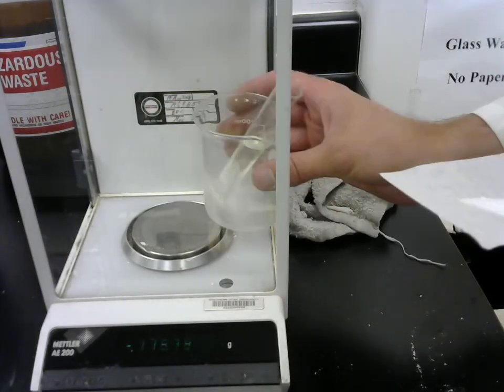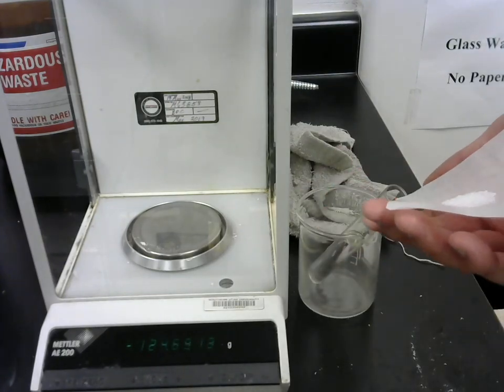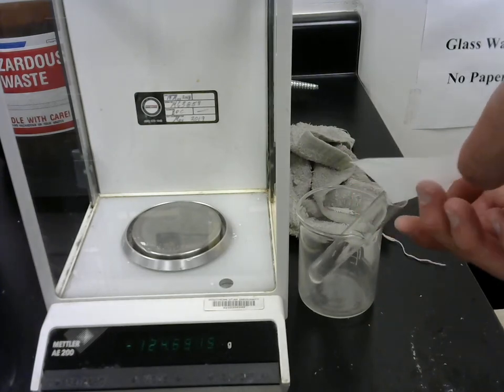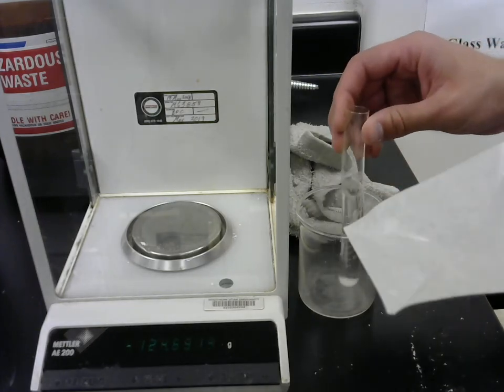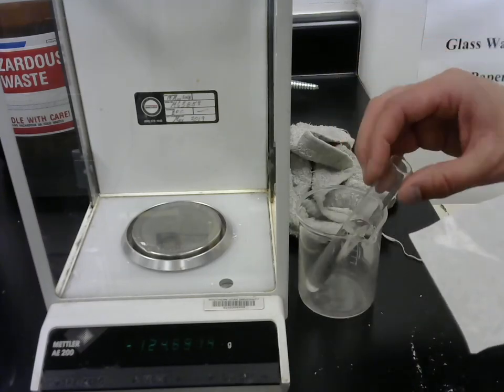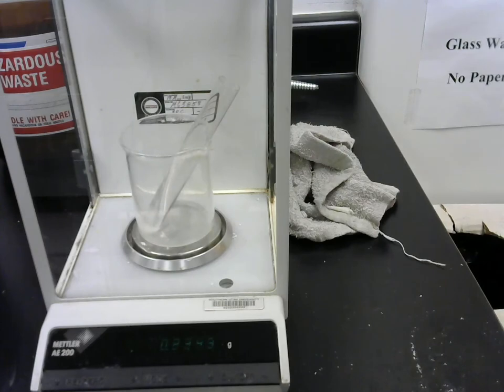We'll add the naphthalene and do our best to get it all in that test tube, but inevitably some naphthalene will probably be sticking to this weigh paper. So let's just see how much we weigh here.